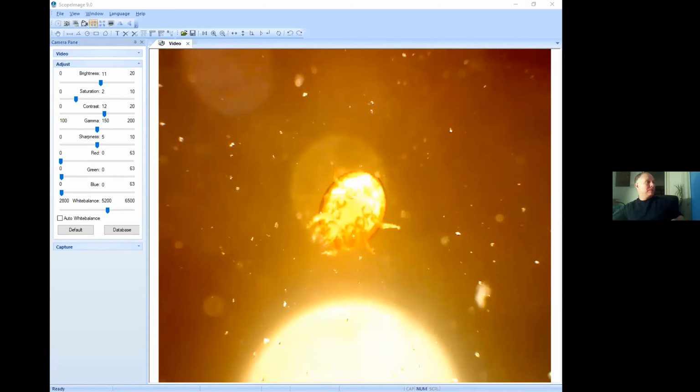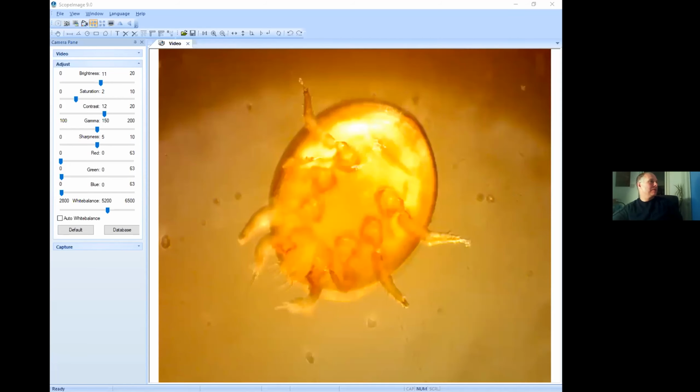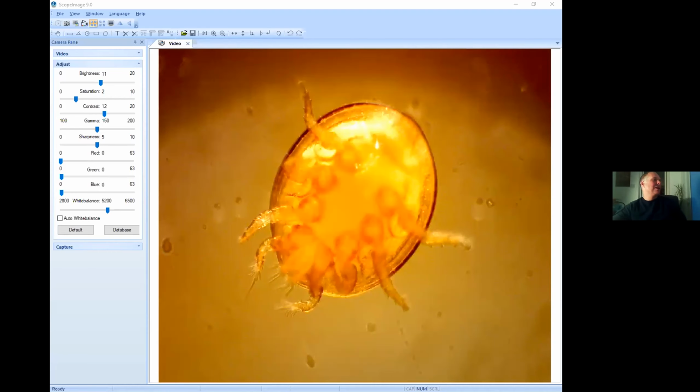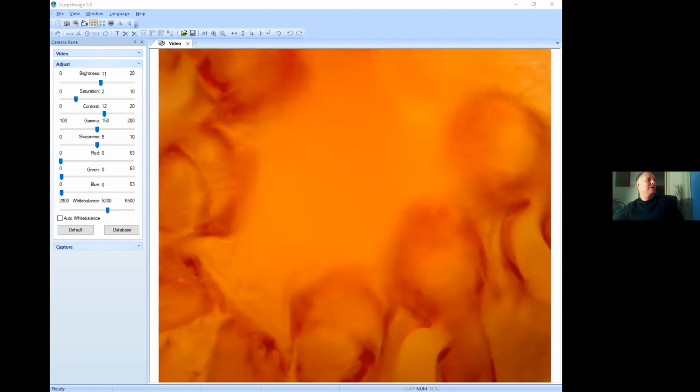So it's a bit overexposed, but there you can actually see the colours. Yeah, it's taking a while to update, and a bit more of the individual features that you get. Even with the ×40 objective, there's less than a millimetre between the objective and the cover slip, and yet that bright LED light is still able to shine in there and show quite a lot of the features on the surface there.